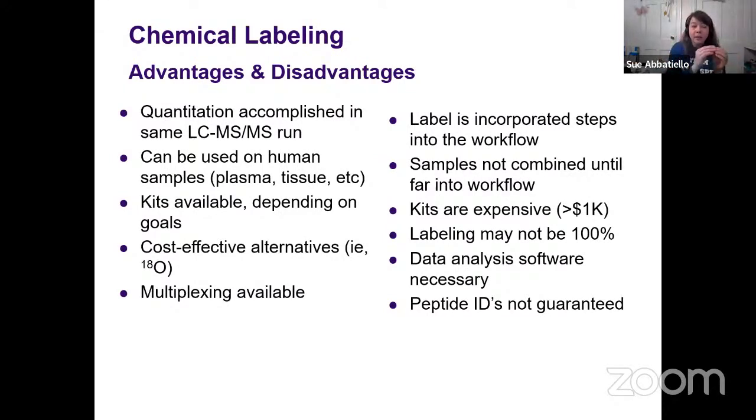By doing this, you're separating your peptides by some orthogonal means. So you're not necessarily using acidic reverse phase, which is what we use for LCMS. You might be using basic reverse phase, so high pH, which separates the peptides in different orders. Or you might be using strong cation exchange, which separates the peptides based on their cationic properties.